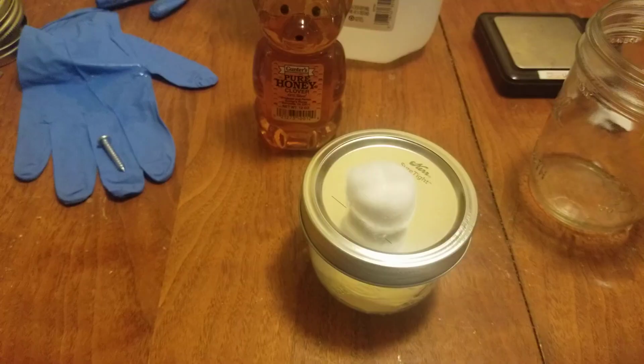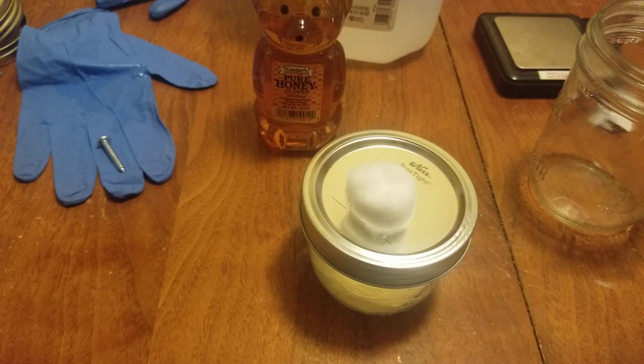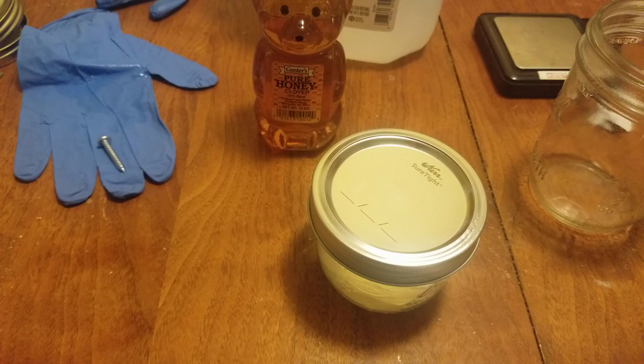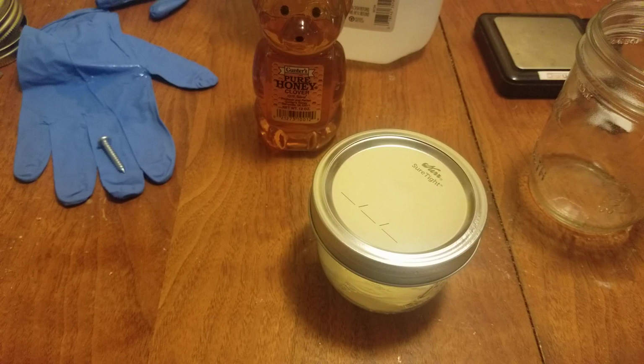All right, ladies and gentlemen, we are finally back after all of that pressure cooking and letting the jar cool down a bit. And as you can see, hitting the top, it is completely sealed, which means we have successfully pressure cooked this jar. Now, if you're using a jar like mine where you didn't punch any holes in the top, the question is, how do I inoculate this? And the simple answer is, of course, we'll punch a hole right through it.